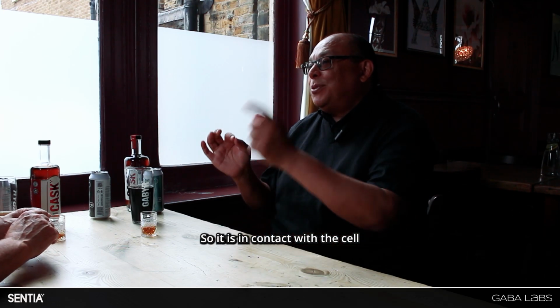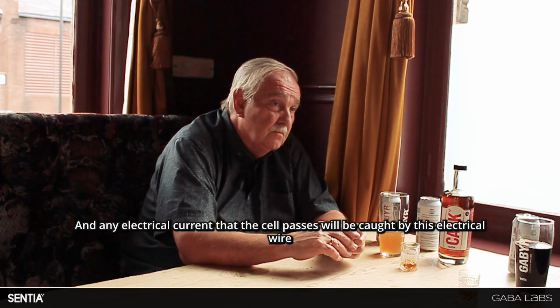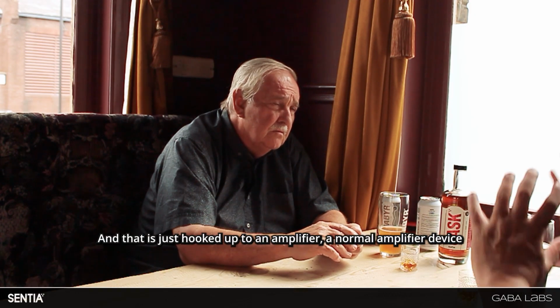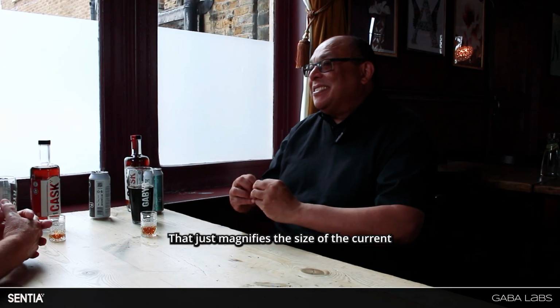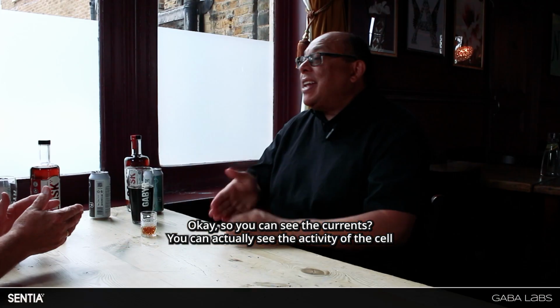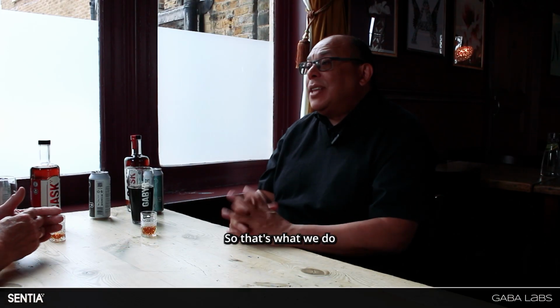So it is in contact with the cell, and any electrical current that the cell passes will be caught by this electrical wire. And that is just hooked up to an amplifier, a normal amplifier. An amplifier is a device that just magnifies the size of the current. Okay, so you can see the currents. You can actually see the activity of the cell. So that's what we do.